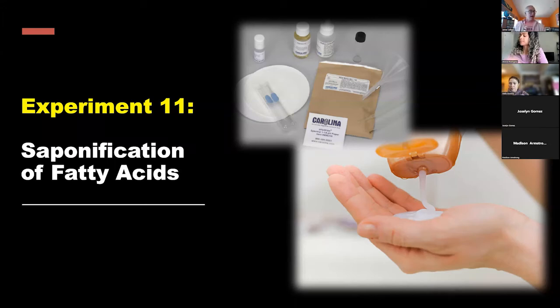This morning, we learned there's a whole bunch of different reactions that carboxylic acids undergo. There's esterification, and they make amides, and all sorts of different things. One of them is esterification in reverse, where we break ester bonds. In this particular instance, it's called saponification, because we are releasing fatty acids, and that's different from your typical carboxylic acid. What's the difference between a carboxylic acid and a fatty acid?